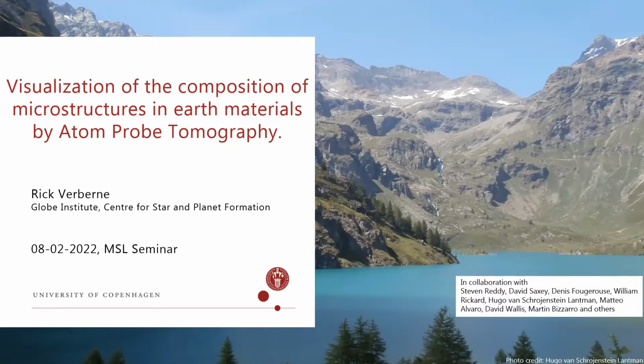So the first thing to say is that the reason we are looking into this is that on that micro and nanometer scale where we operate when using Atom Probe Tomography, a lot of diffusion profiles and the transport of trace elements are controlled at that scale, which is one of the reasons we are interested in this. But we can also derive a lot of information about, for instance, the geochronology of samples by looking at very detailed, for instance, lead compositions that are lost with larger analytical techniques.